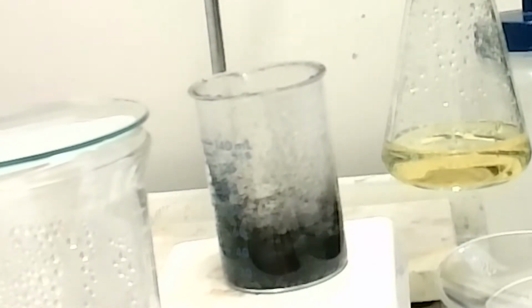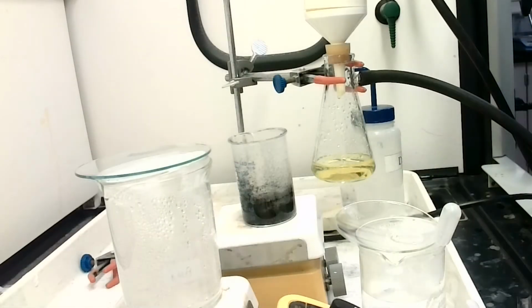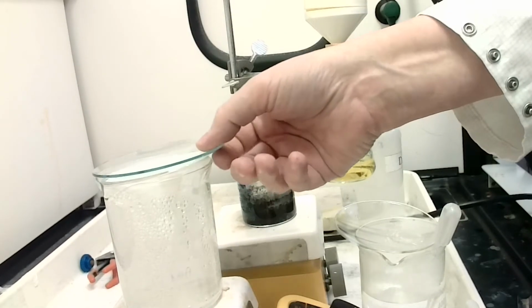I want to make a comment here. So the main thing you want to think about with discoloration here is that yes, obviously you see the black, right? But the yellow brown is gone now. And we'll get rid of the black at the next step.